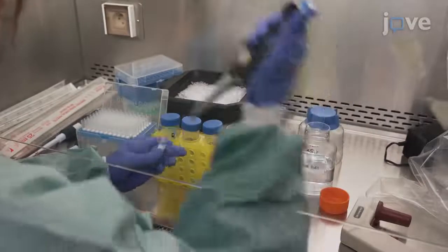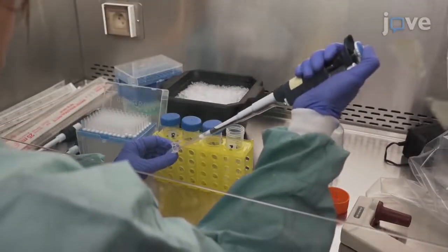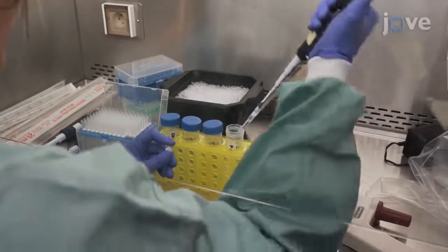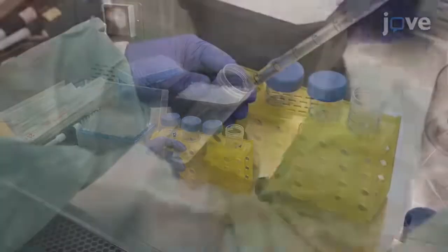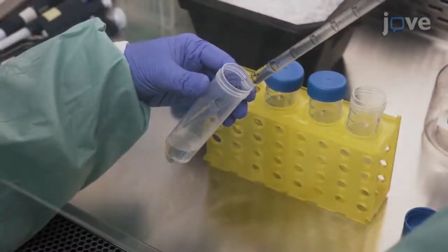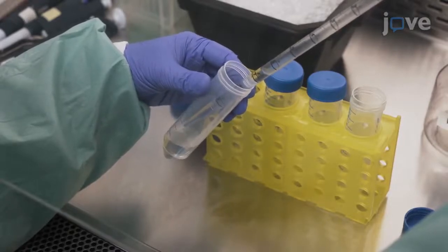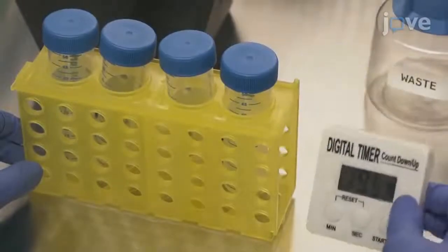In a new conical tube, mix 840 micrograms of PEI in 6 milliliters of 150 millimolar sodium chloride to prepare the PEI mix for 6 cell culture dishes. Then, add 6 milliliters of the PEI mix drop by drop to one of the conical tubes containing the DNA mix. Incubate at room temperature for 20 minutes.